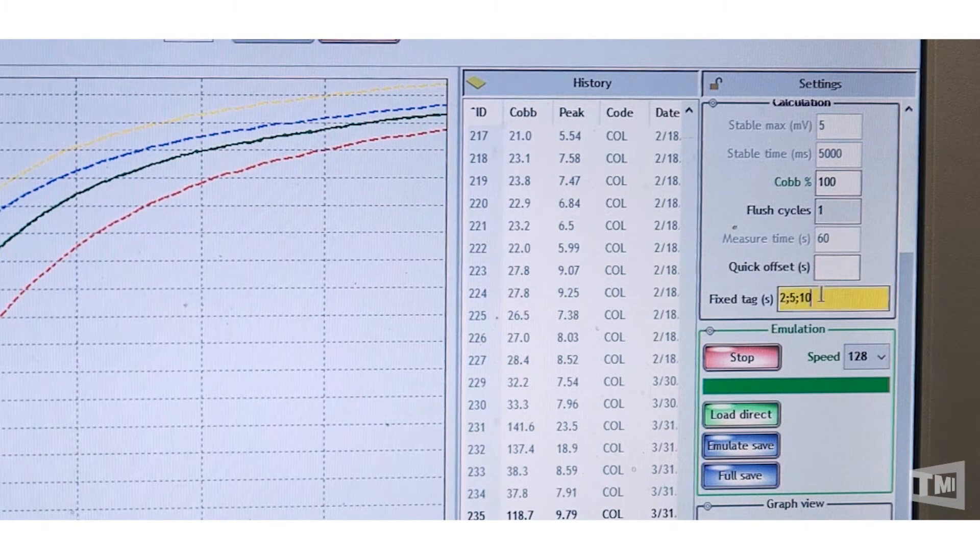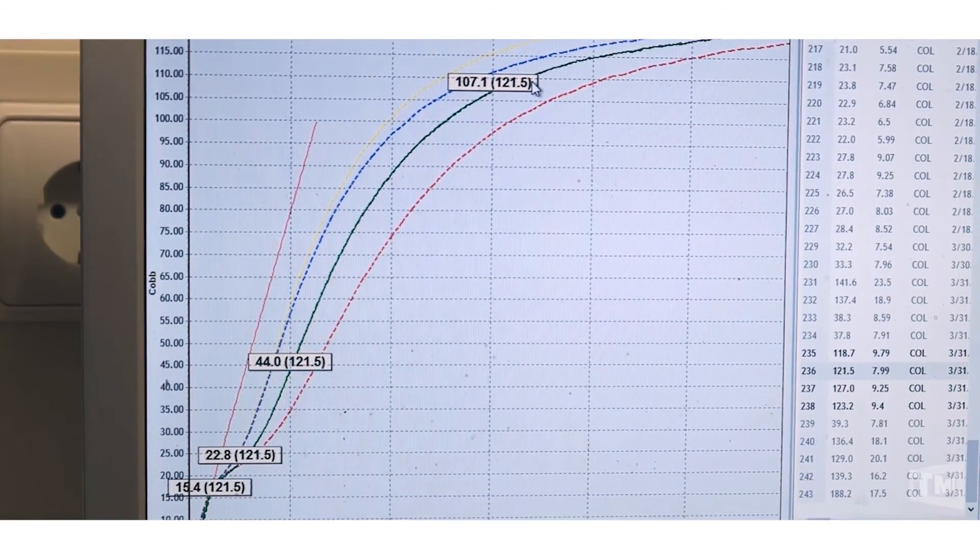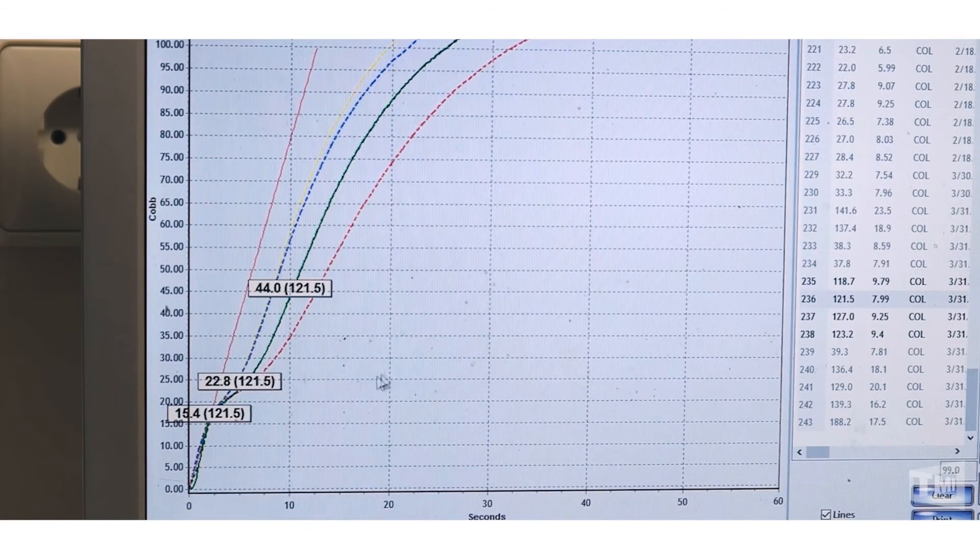We can change these, we can add, say we want to add 30 seconds. What happens at 30 seconds? So we'll just add one at 30 seconds. As I said earlier, the more important portion of this curve is in the area where it first enters, the water enters the paper. The initial absorption of water into your paper. That's what we're trying to achieve here.